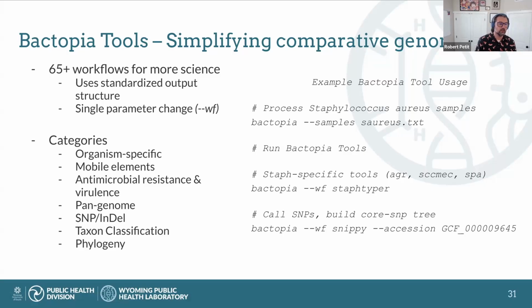So the basic unit is the sample, it's not the run. That way, this allows you to continuously add samples over time instead of having to add runs together, which is a bit more tedious, whereas now the samples can be moved around as needed.